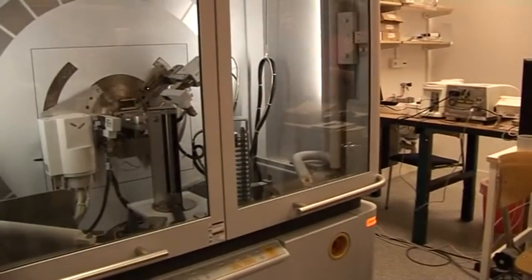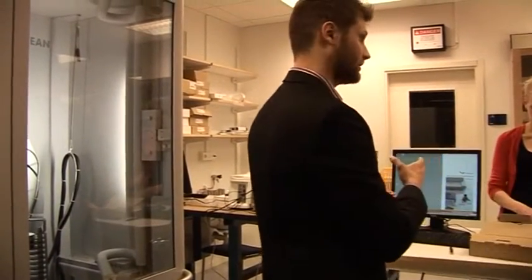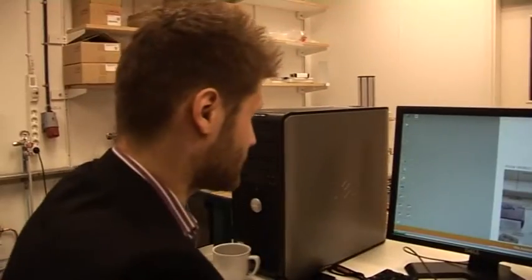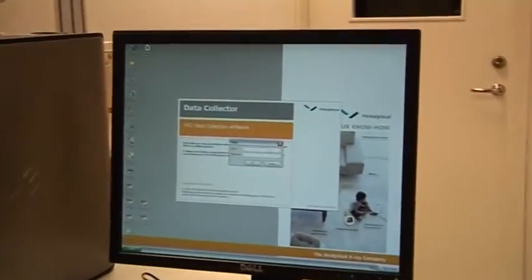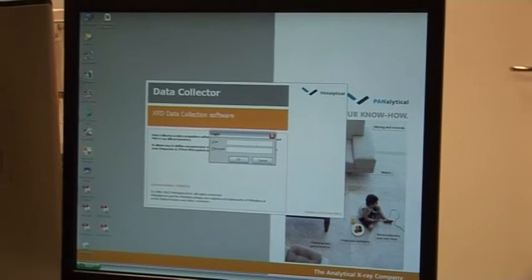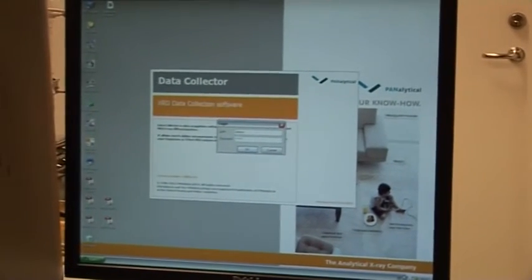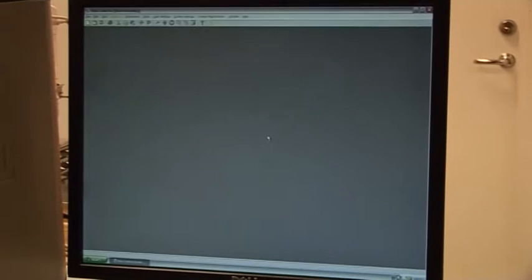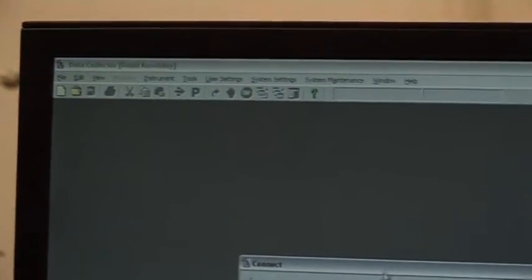So now we're done with the sample preparation and then everything is in, so we can just try to make a program with the settings that we want to use for the scan. The software to operate the instrument is called Data Collector. So we start this Data Collector. Then we have to log in.